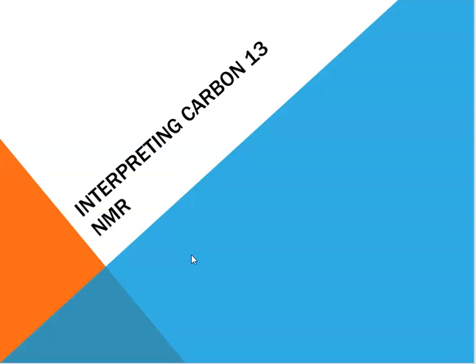carbon-13. If you do remember, carbon-13 is unique because out of the three isotopes of carbon, carbon-12, carbon-13, carbon-14, carbon-13 has some magnetic properties, and so spinning electrons around the carbon give it a magnetic field that we don't see in the other two isotopes. At any rate, we're going to take some of the structures that we have here in the upcoming presentation and relate them to what we see on the spectrum.